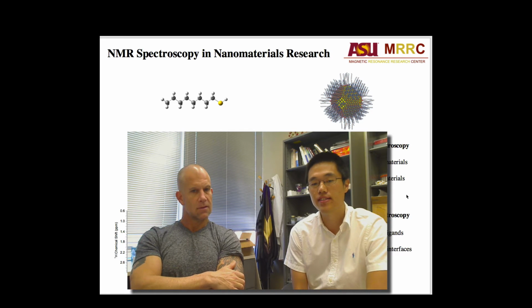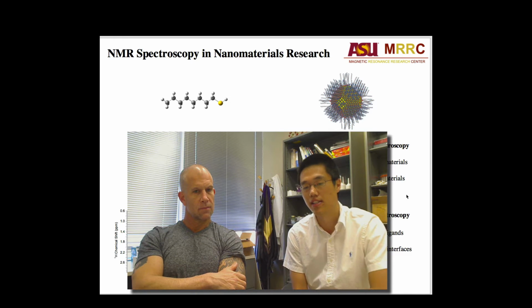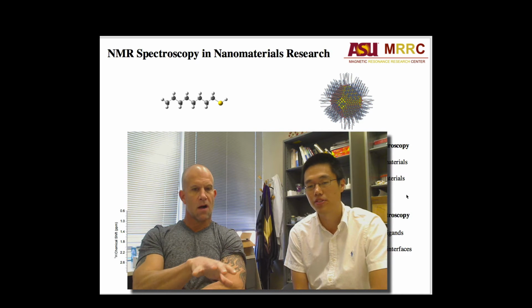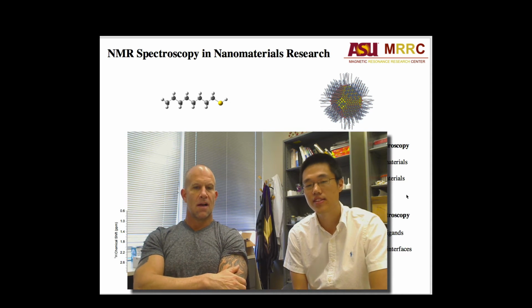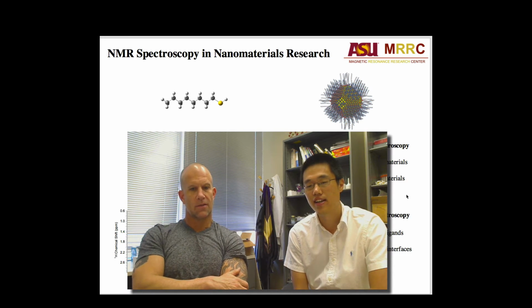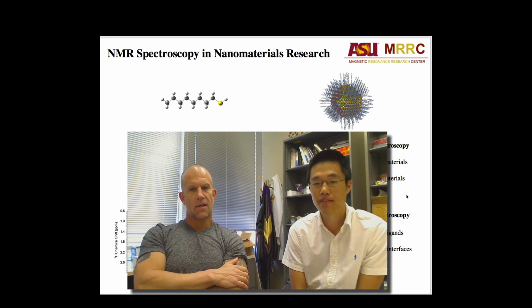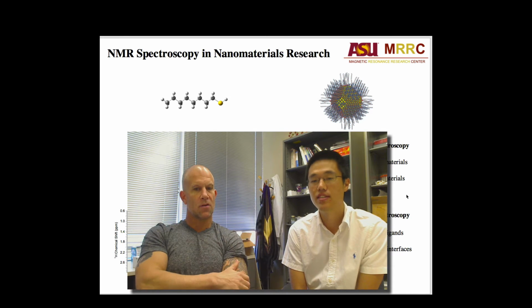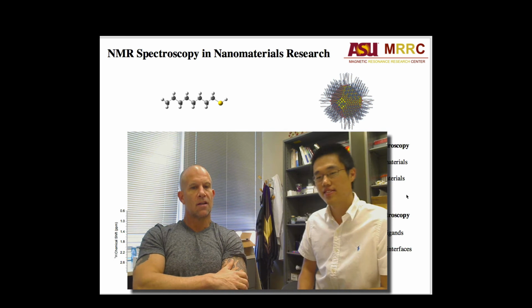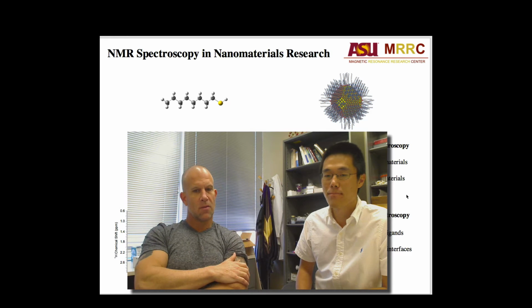The molecule I show here is a very typical organic molecule people use in nanomaterial synthesis, especially for gold nanoparticles. It's octanethiol, and it's common in gold because of the sulfur-gold bond that makes a very strong bond to gold. Yes, directly. Exactly. And then the picture you show on the right is octanethiol that's been bound to gold nanoparticles in an arrangement and a surface coverage that people feel is pretty typical. Yes. And about what size is the gold nanoparticle you're showing?